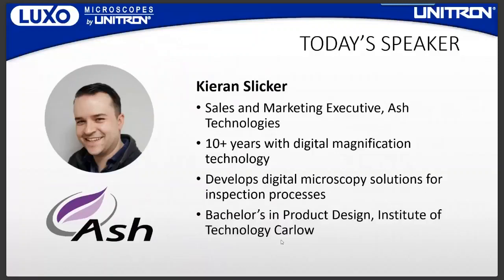All right, thanks, Mark. Just let me share my screen. Can you see that okay? Sorry, can you see that?